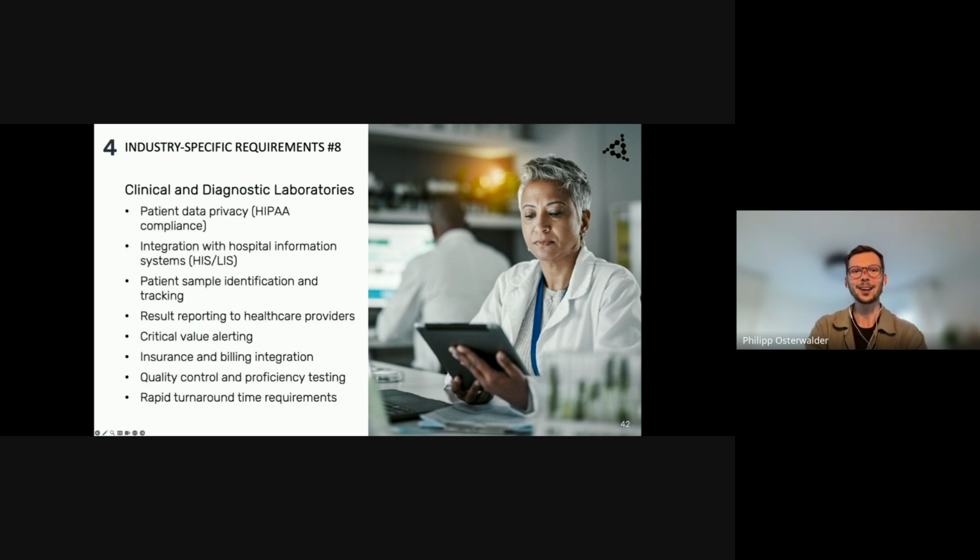Clinical labs handle patient privacy under HIPAA or GDPR. Integration with hospital information systems is often required, as well as rapid turnaround times for test results. In this environment, a LIMS must manage patient ID cross-referencing, automate critical value alerts, and often connect with billing or insurance platforms.